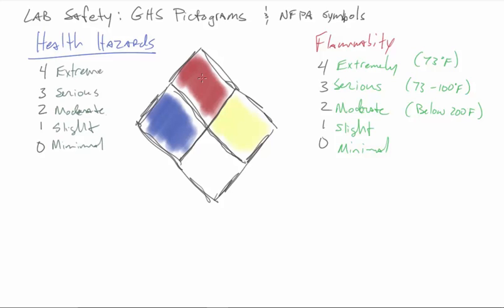And so if I'm looking at something here and I have something that's 4 and something that's 3, the numbers just appear there in black. If I had something that was 4 there, that means it's going to blow up at room temperature, and then when it blows up and spreads everywhere, it's going to kill me. Don't want to mess with that guy. All right? Don't want to be there.